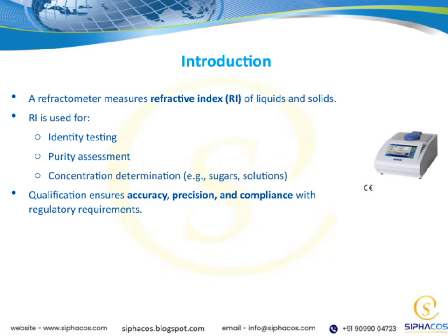But just having a refractometer isn't enough. We need to ensure it's properly qualified. That means verifying that it's accurate, precise, and meets all necessary regulatory standards. This qualification process is essential to make sure our measurements are reliable and compliant with industry requirements. So, understanding how to use and qualify a refractometer properly is fundamental to maintaining quality and consistency in our work.